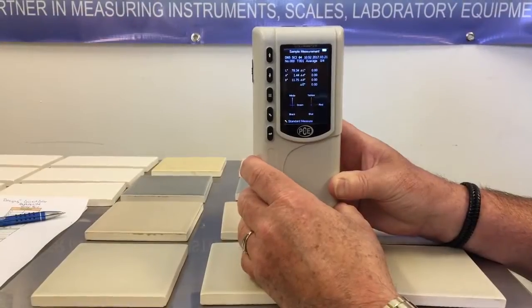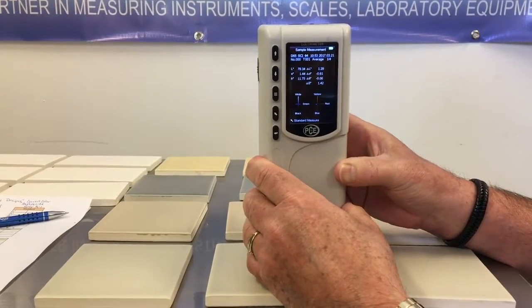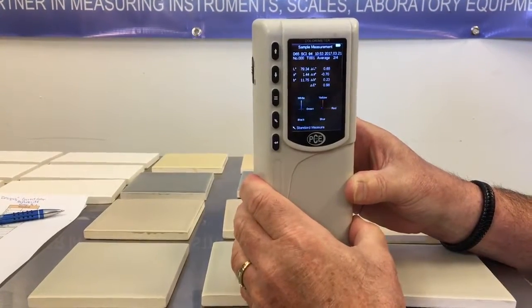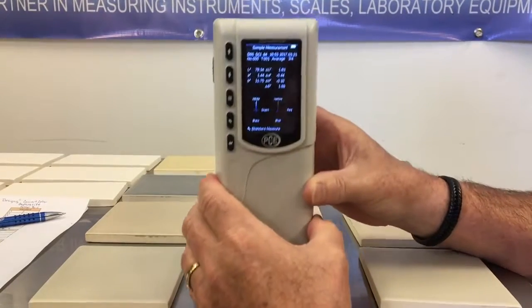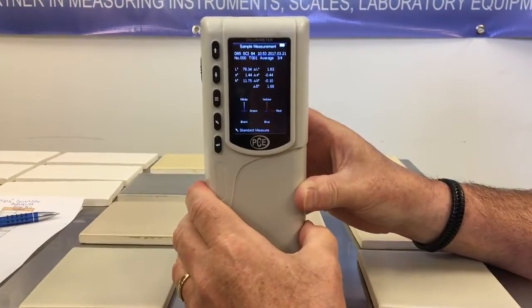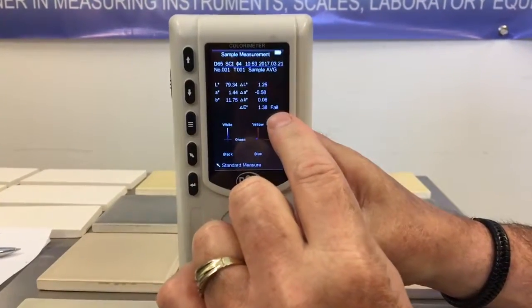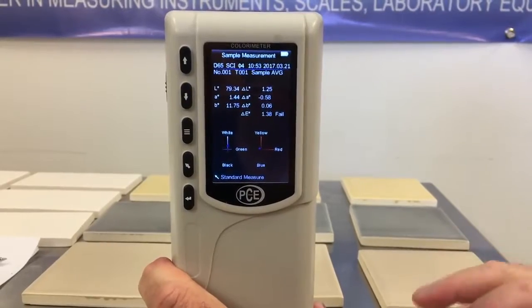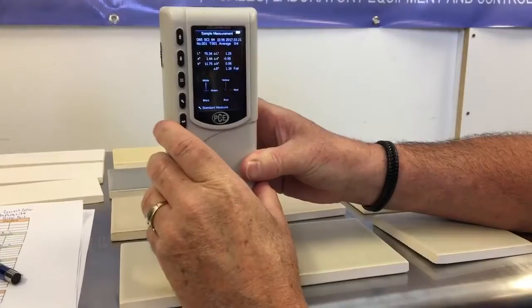Now we're going to check the samples. This is our first sample — one, two, three, four. Notice that it says delta E failed. This color failed by 1.38 from the delta E of the previous color, which was our standard.